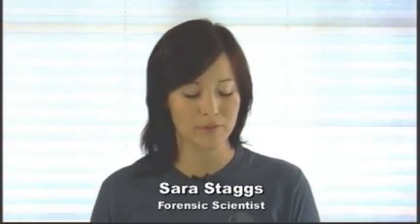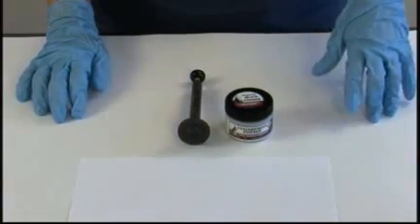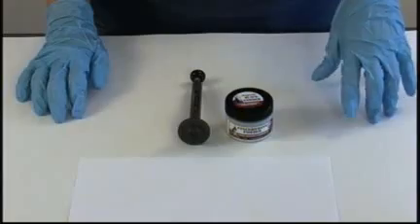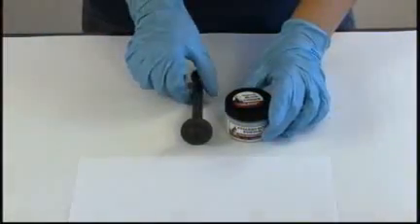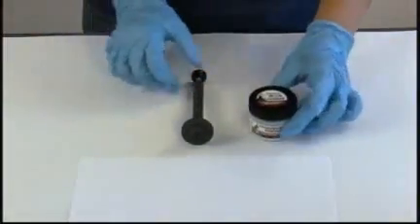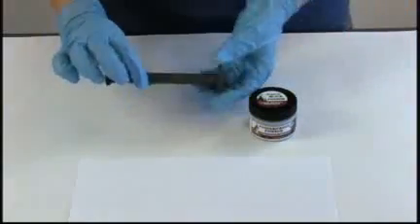For this video we're going to be developing latent prints with magnetic powder. The tools we'll be using are magnetic powder and the magnetic powder wand.